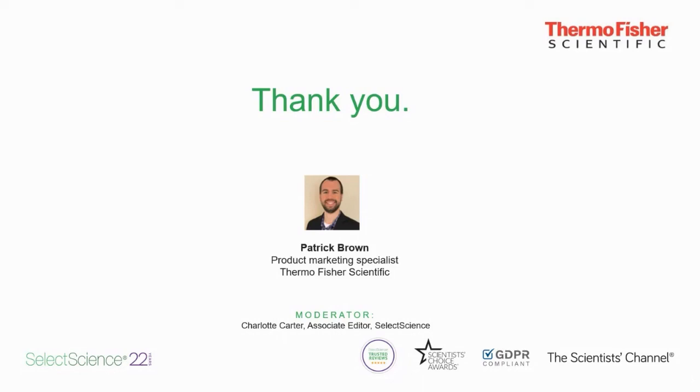cuvette temperature to 37°C. Some of our other cuvette-based spectrophotometers, I'm thinking about our Evolution line from Thermo Scientific, do have Peltier devices, but that would not be on a microvolume scale. That would be in a cuvette-based measurement. Great, thank you for clarifying that one.